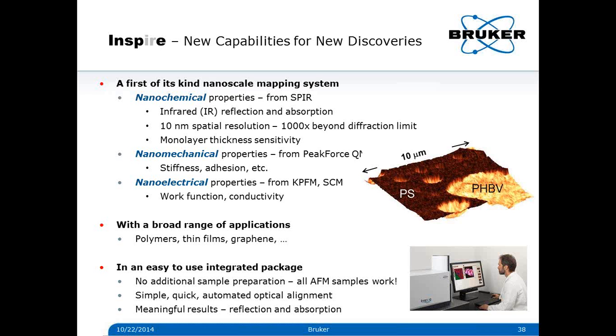So if it's below, let's say, 50 nanometers in depth, then you might not see a big contrast, because SNOM or SPIR is a technique that can probe down to 50 nanometers or sometimes up to 100 nanometers, depending on your system. So people have shown that you can image the electron distribution in doped silicon down to 100 nanometers. So it depends a lot on your system and the size of the particles. If it's too small, like a nanometer, then it might be difficult.